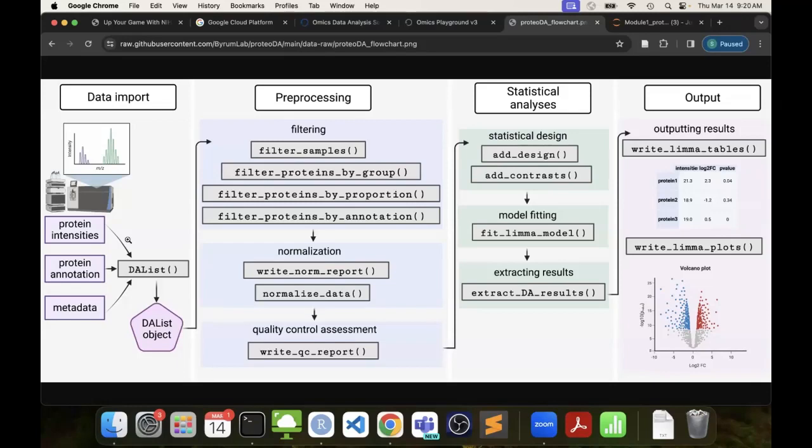So if you have a number for your animal, you'll see I put like S in front of it for sample something just because I can't use a number in R. It can't start with a number. It has to do with the columns and the labeling in R. It needs to have a letter to start with so that it doesn't think it's a numeric factor. You don't want to make it a number. So that's got to be a factor.